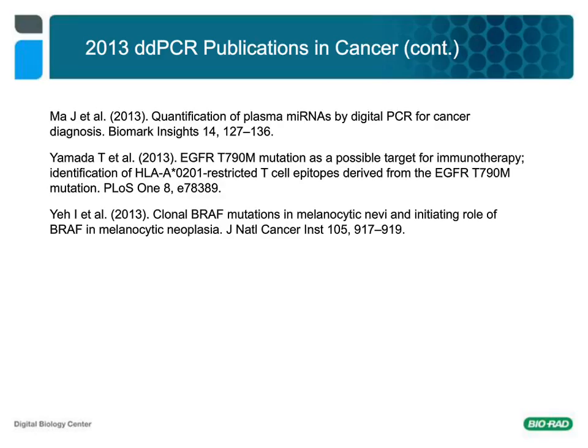So if we move back to our questions now, our next one is, can you achieve sensitivity higher than 1 out of 20,000? Oh, absolutely. The 1 out of 20,000 comes up frequently because in one well we have 20,000 droplets, but we have this beautiful ability to merge our wells into what we call meta wells. So in one plate, in theory, you could merge all 96 wells and have 20,000 times 96 droplets.